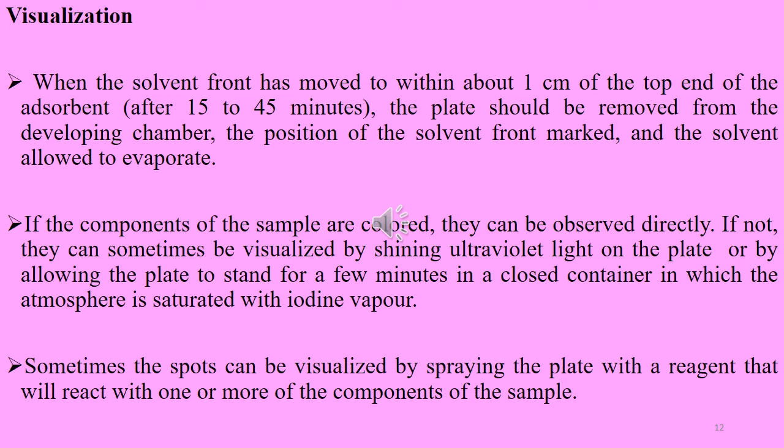After that, visualization of the spots is done when the solvent front has moved to about 1 centimeter from the top end of the adsorbent. Approximately after 15 to 45 minutes, the plate should be removed from the developing chamber and the position of the solvent front marked with a pencil, and the solvent is allowed to evaporate.